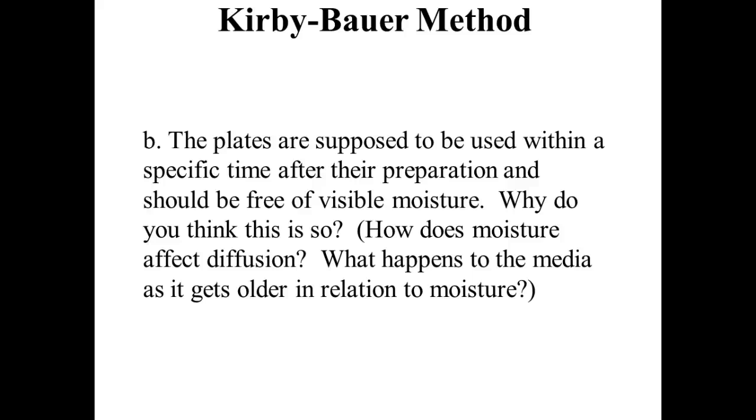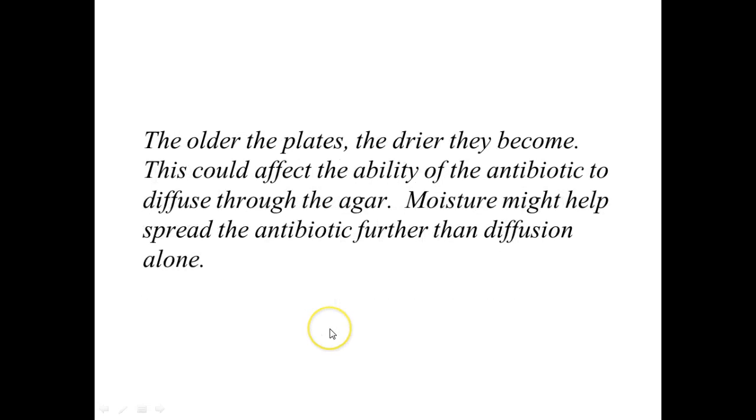So here, the example they're saying, they don't give us a specific one. Suppose a specific time frame, free of visible moisture, right? So if it's too moist, it's going to be a larger zone, right?